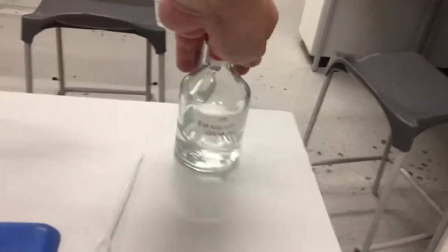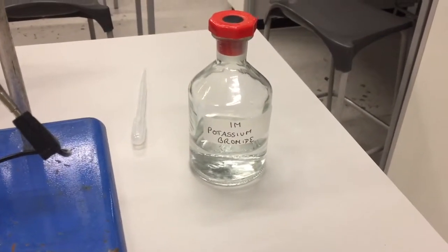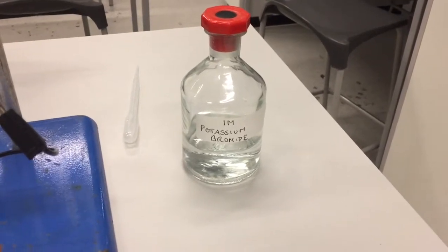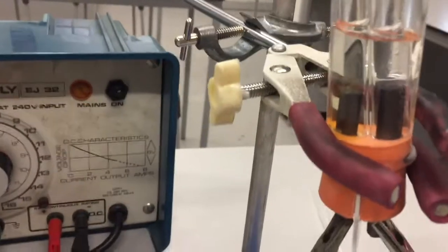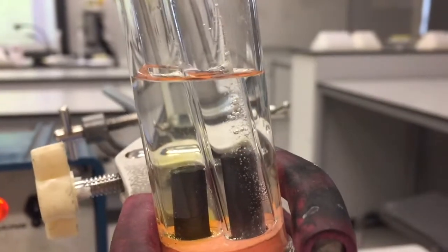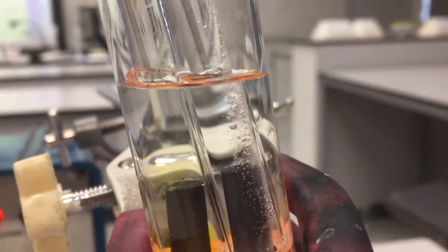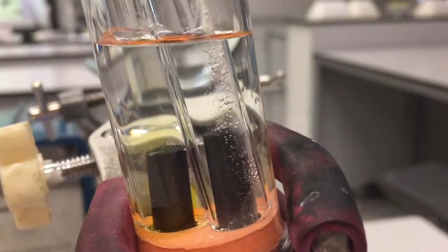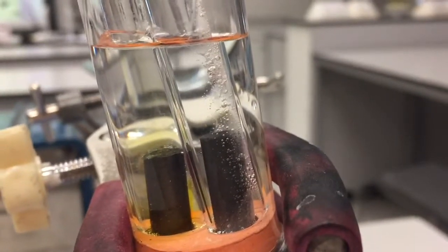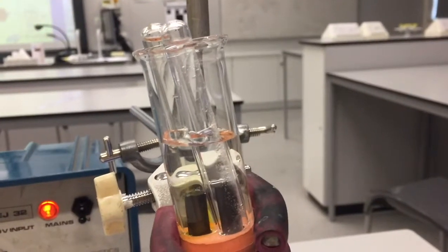Over here we have potassium bromide. Now this time potassium is more reactive than hydrogen. Because it's more reactive than hydrogen, when we switch on the apparatus, we're going to find at the cathode you're getting a streaming bubble of gas. You're not getting a metal plated on here because potassium is more reactive than hydrogen, so the hydrogen gets produced instead. The hydrogen can be tested using a lighted splint for the squeaky pop test.